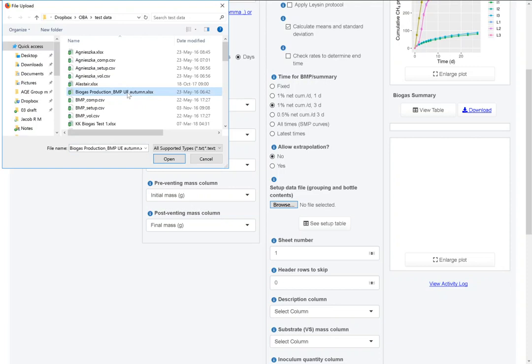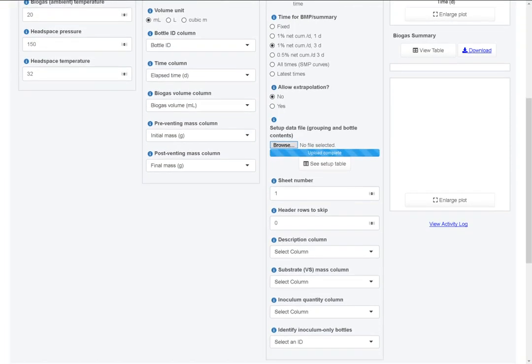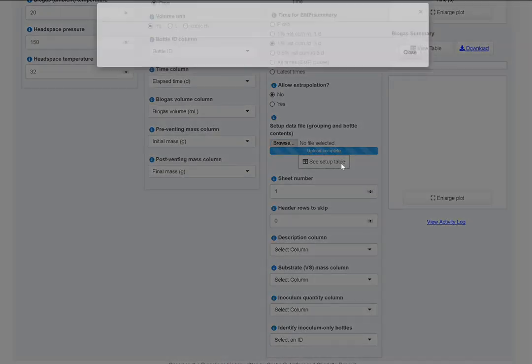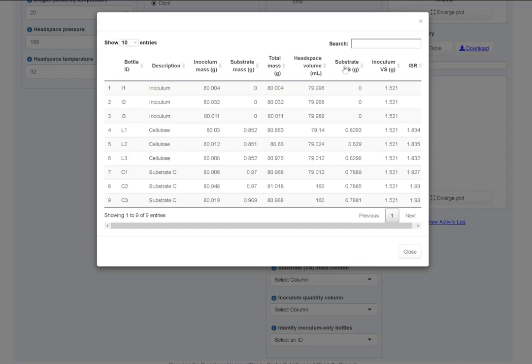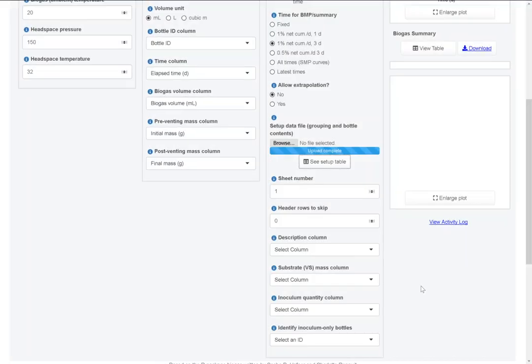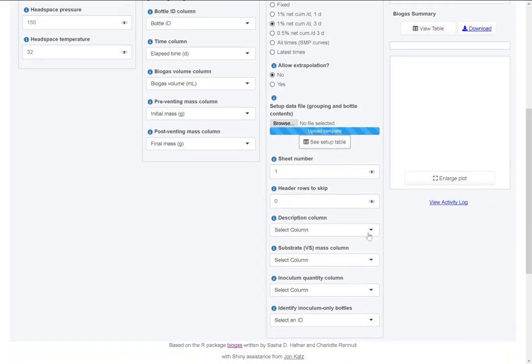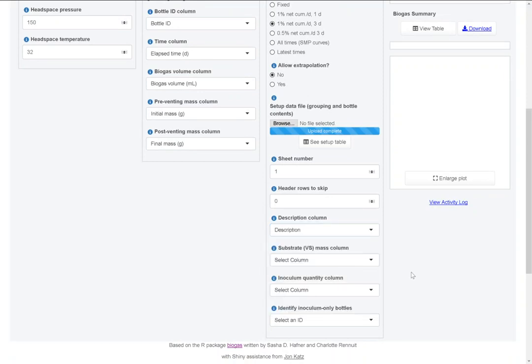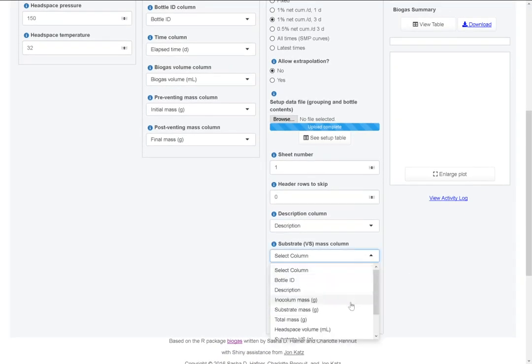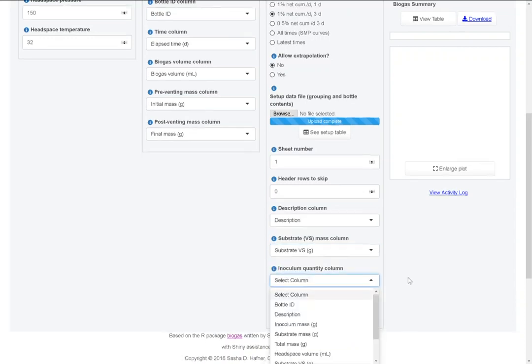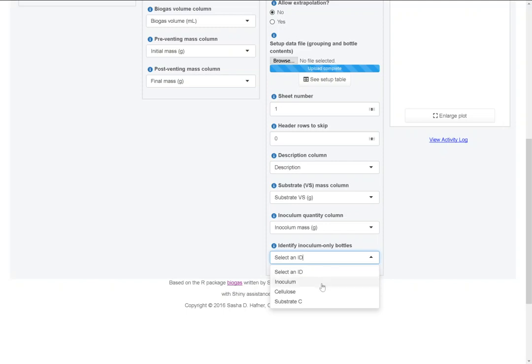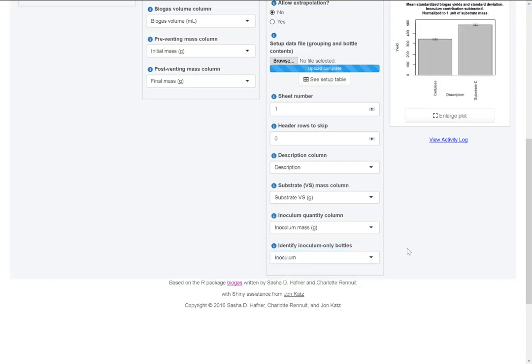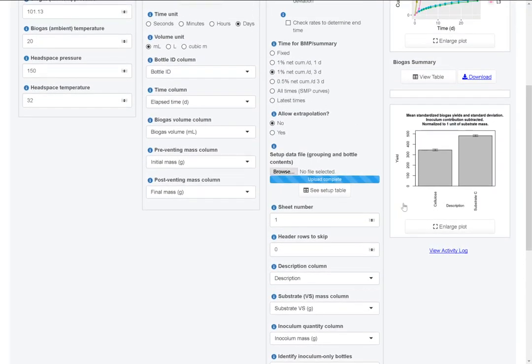Let's get our setup data. These are from the same file, this is the first sheet. So sheet 1. Let's take a look at these data. These looked correct. We're going to use the description column for grouping. Then we need to specify inoculum mass and substrate VS mass because we'll normalize by substrate VS. So let me select these columns. We need to indicate which description means inoculum only.